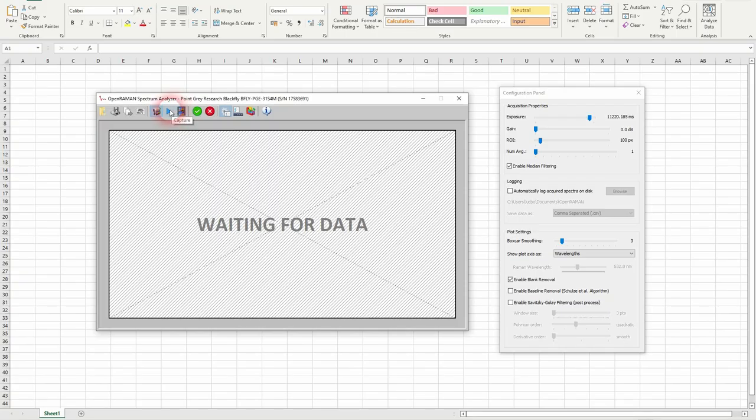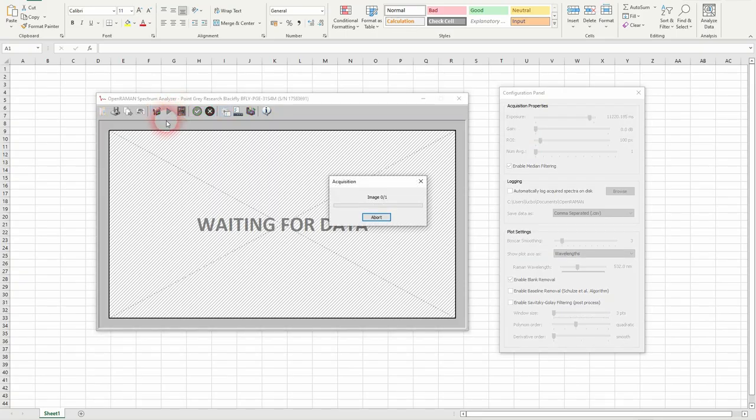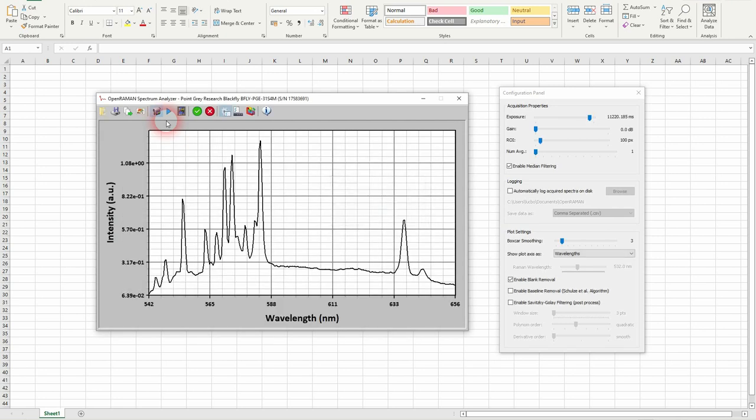Now I can switch my laser back on and take a new image. And that's our final spectra of salicylic acid.